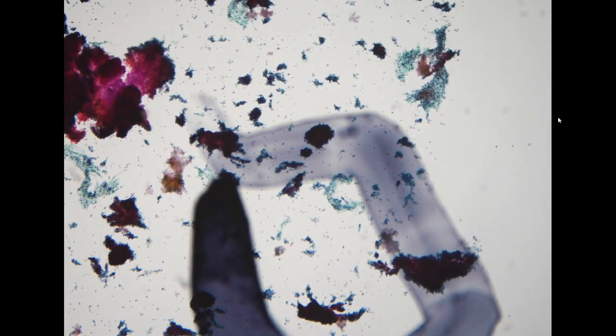Next is a relatively uncommon and unusual specimen coming from a 56-year-old male with a parotid mass. The clinicians say it is 15 centimeters. It is a very large, very big parotid mass, 15 centimeters.